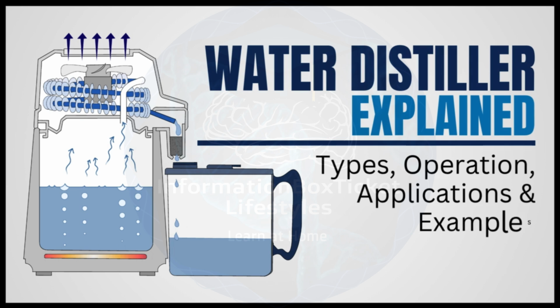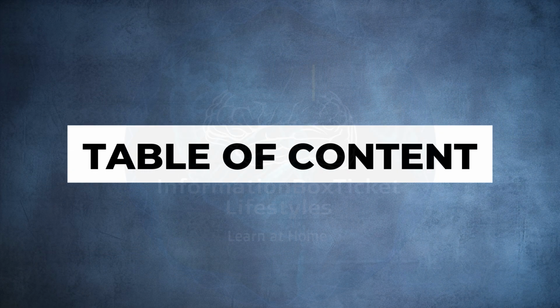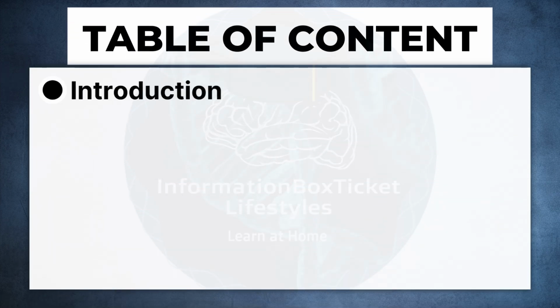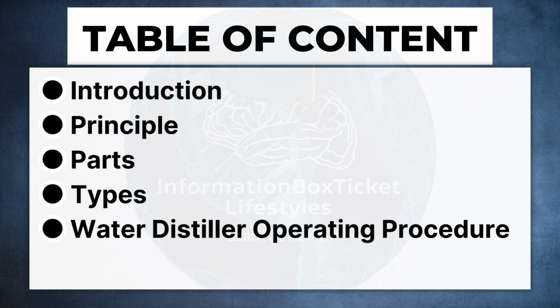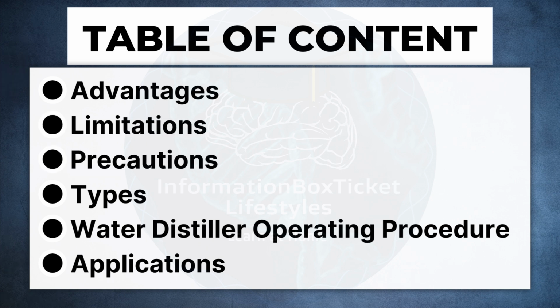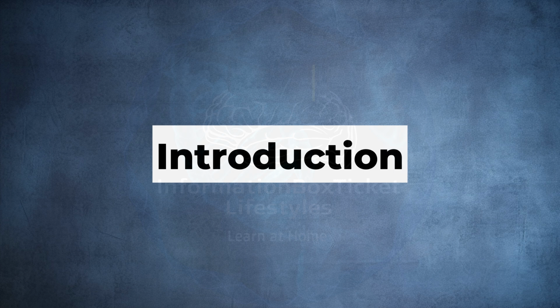Water Distiller explained. Table of Contents. Introduction. Principle. Parts. Types. Water Distiller operating procedure. Applications. Advantages. Limitations. Precautions. Water Distiller examples. Introduction to water distillers.